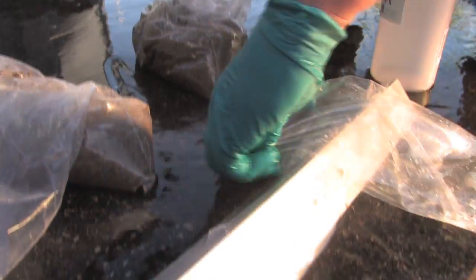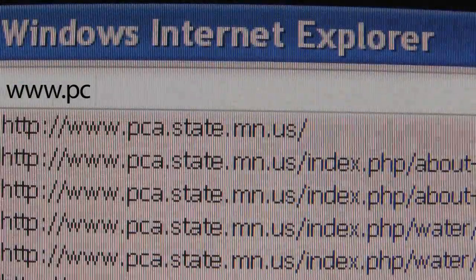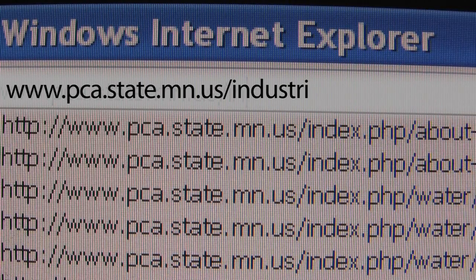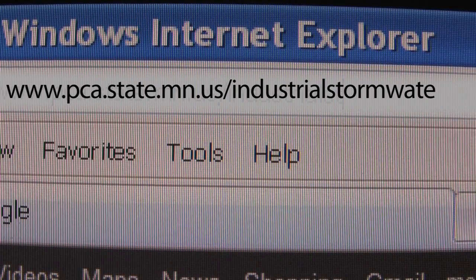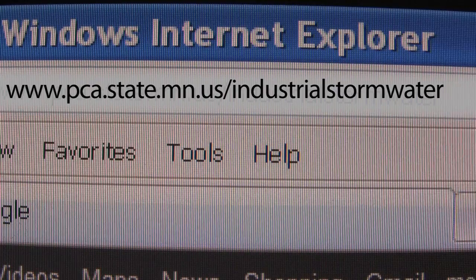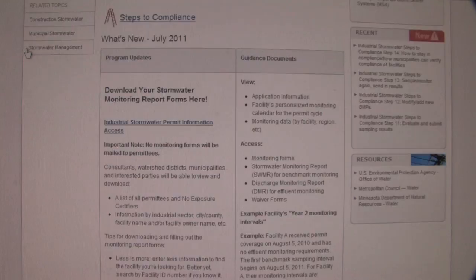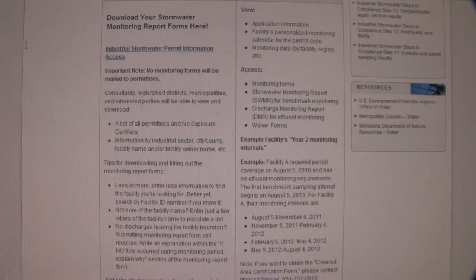That's it! Today I collected a stormwater sample from a culvert using the grab sample method. For more information, including the best sampling methods for your facility, visit the program's website at www.pca.state.mn.us and go to the What's New section to find the sampling manual. It is filled with more detailed information about all six parts of the stormwater collection process.